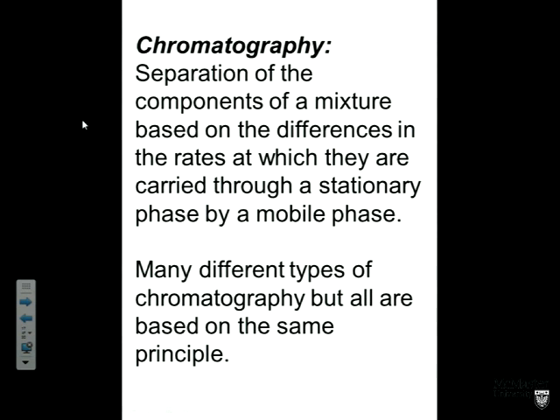Molecules will be exchanging between the two phases very rapidly, i.e. they are at equilibrium between the two phases. And so, depending on the nature of that equilibrium, if the molecules are 90% on the stationary phase, then they're only 10% in the mobile phase. Only 10% of the molecules are moving as the mobile phase moves forward, and the compound will stick quite tightly to the column.